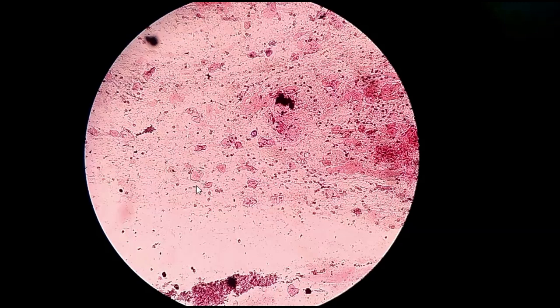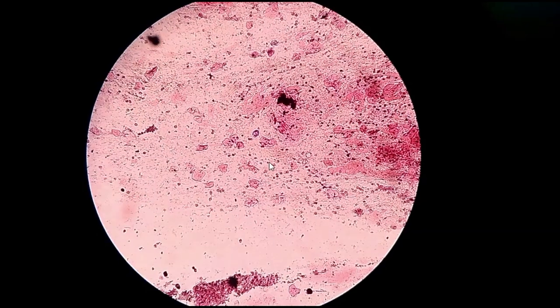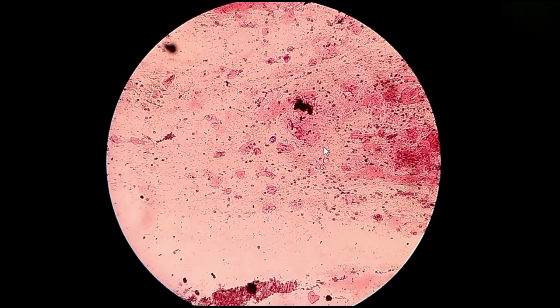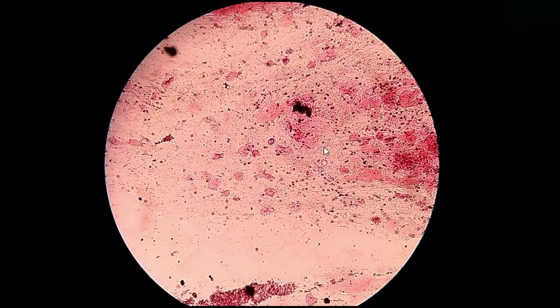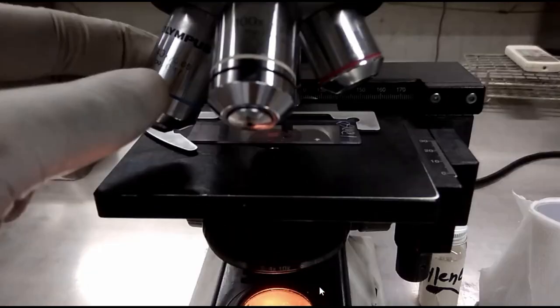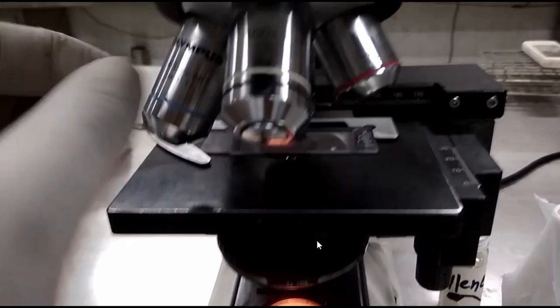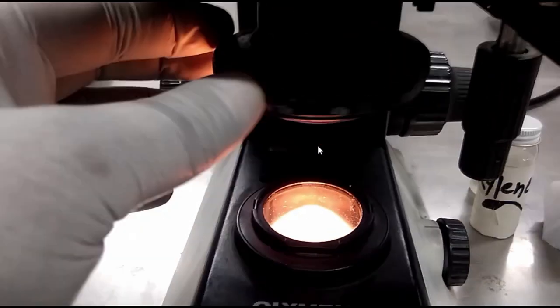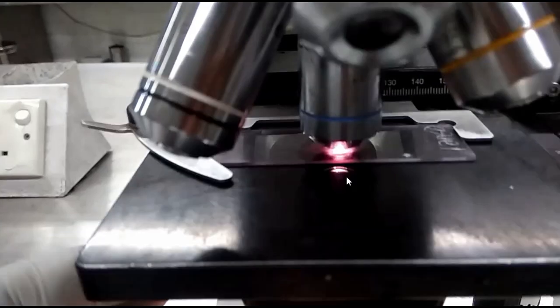So this is an epithelial cell and this one a pus cell at the 10x objective. Let's try to observe at 40x. In this condition, we only have to use fine adjustment and shift from the 10x to the 40x objective, but we also have to adjust the aperture, and nothing more. At 40x, the aperture is adjusted for that.